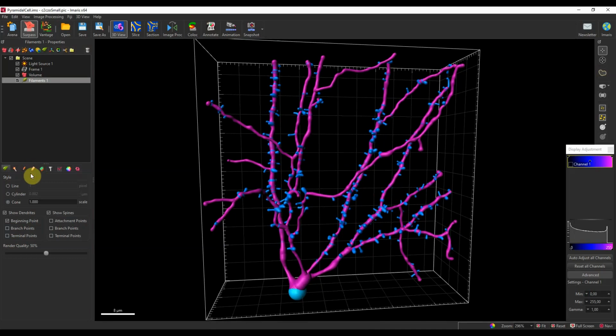When it comes to these two, the edit tab and the draw tab, this is again a topic that will be covered next week. So I will skip this topic. I will directly go into the filter.